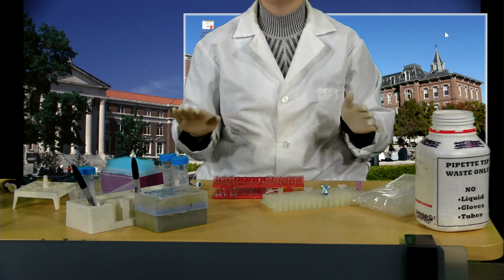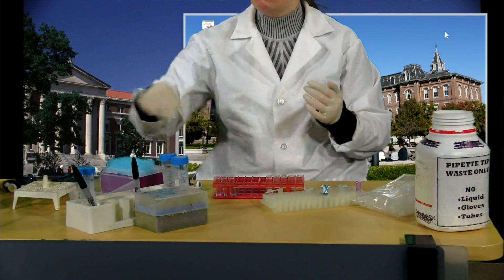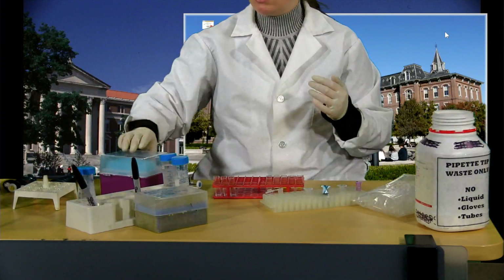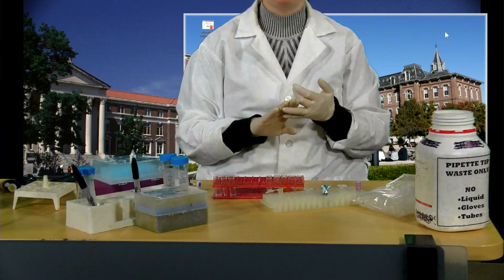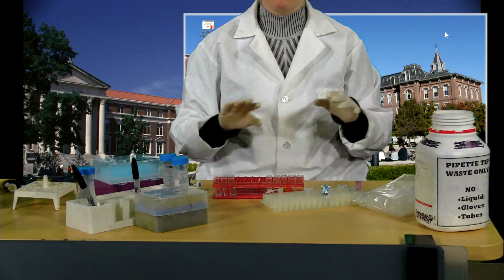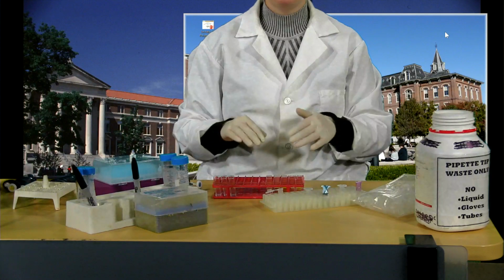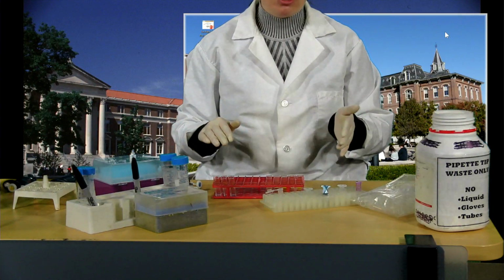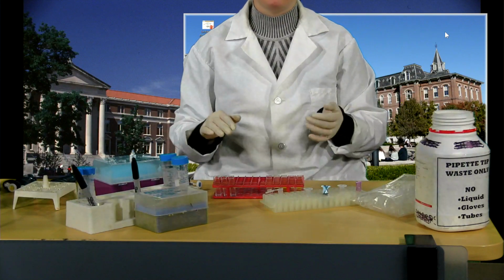Setting up this part of the experiment shouldn't really take you very long. As you can see, pretty much you're just going to set up some dilutions, you're going to set up your incubations, and as long as you are organized and you plan ahead of time what you're going to do, then there shouldn't really be any issues, and it shouldn't really take you any more than, I would estimate, around 10 or 15 minutes to do this.